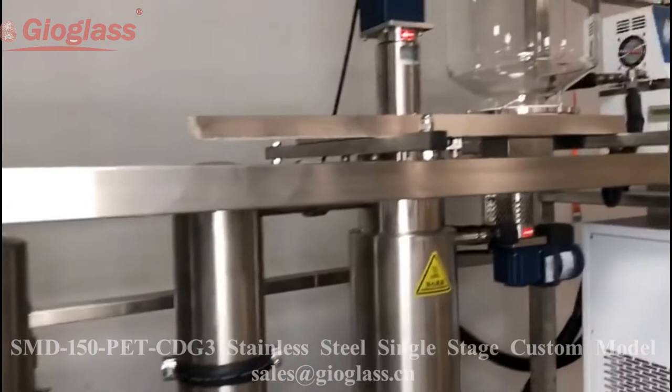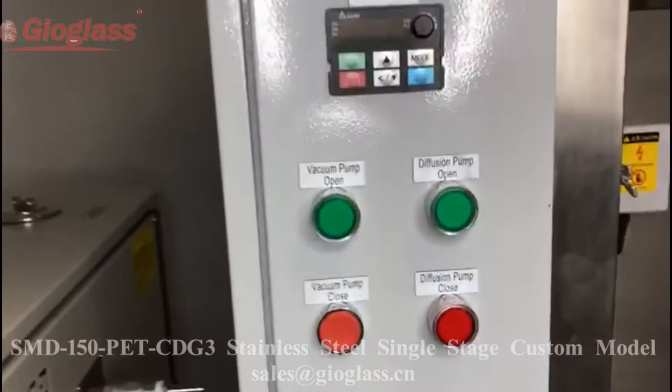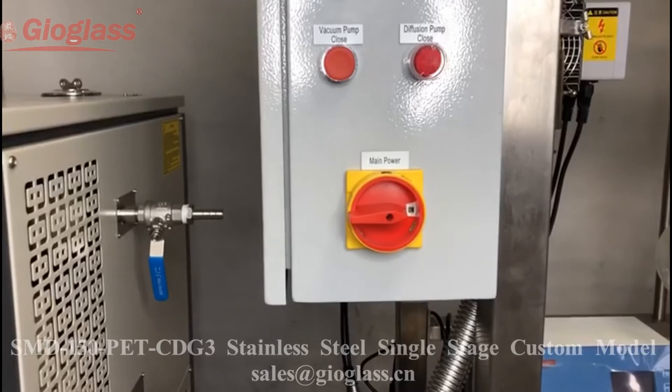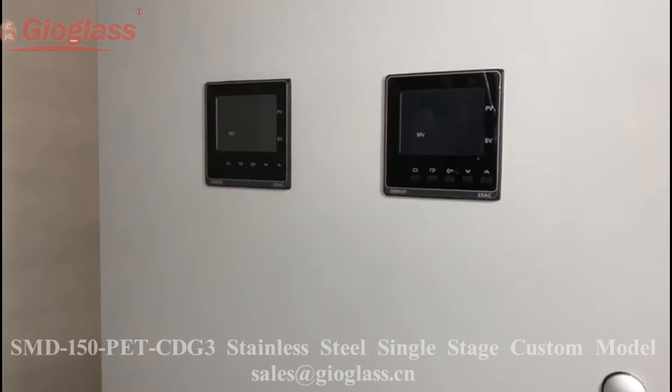This is for the rotor motor. This button is for the diffusion pump power. There are two temperature gauges on the backside.